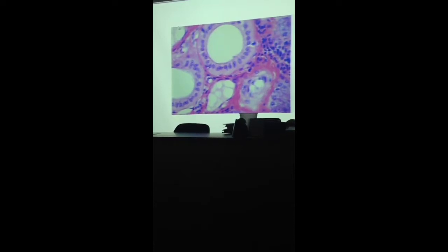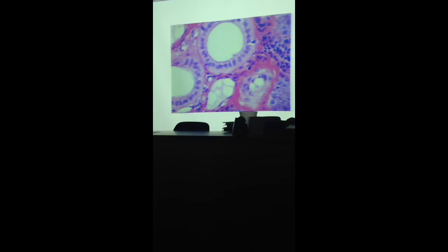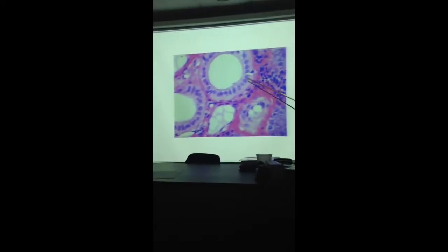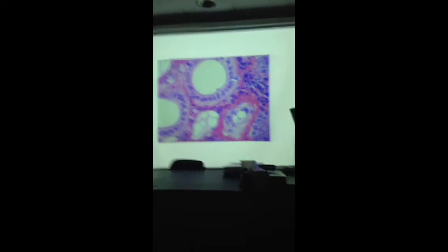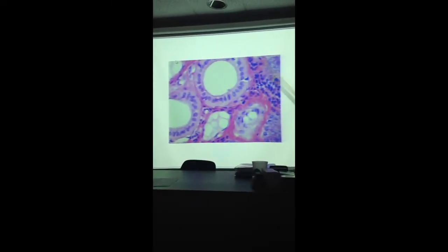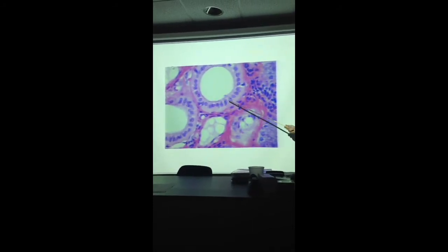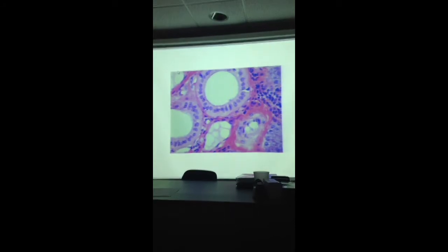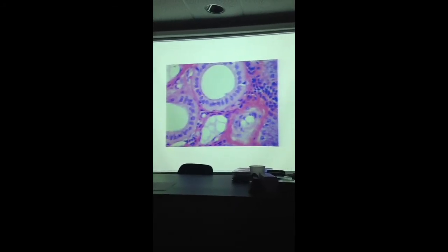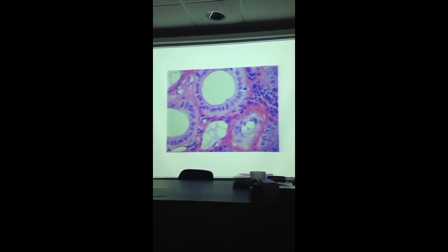And what is this? Salivary gland duct. How do we know it's not a blood vessel? Look at the wall. What kind of epithelium do we have here? Simple cuboidal, as evidenced by the circular or spherical nuclei. Single layer. So the small salivary gland ducts are usually a simple cuboidal epithelium. The large ones you're going to see are often stratified.